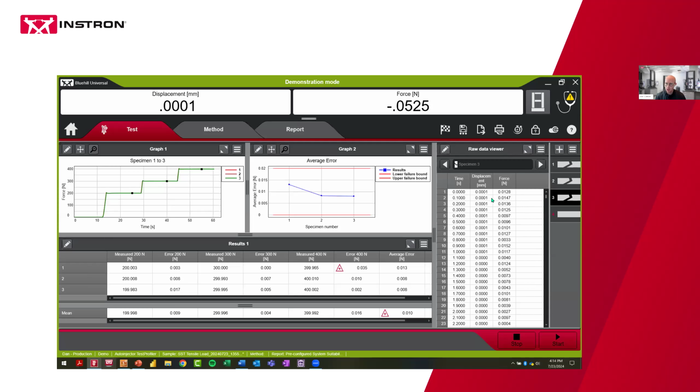And so what this feature allows you to do is say that, okay, I know that the test collected 604 points, but for the purpose of the CSV file that we're trying to output from the system, I don't need 600 points. I need something less than that. So people might do that for a couple different reasons.